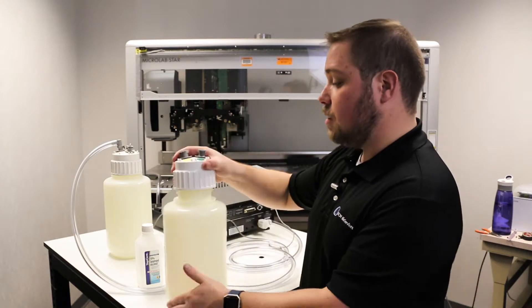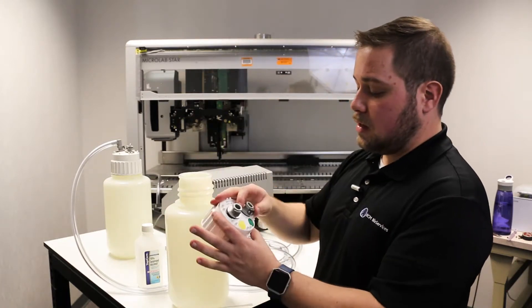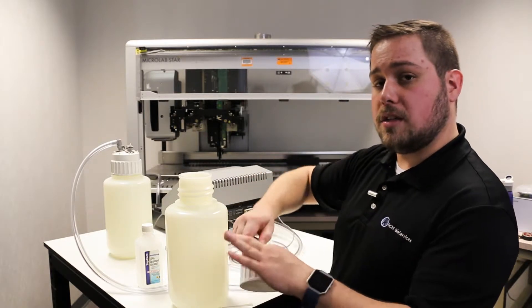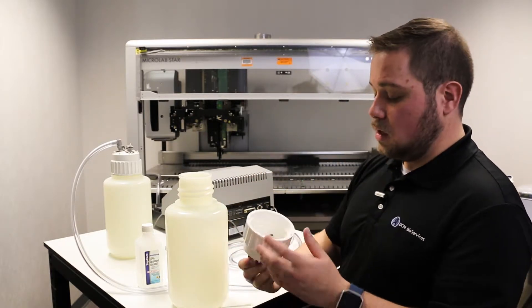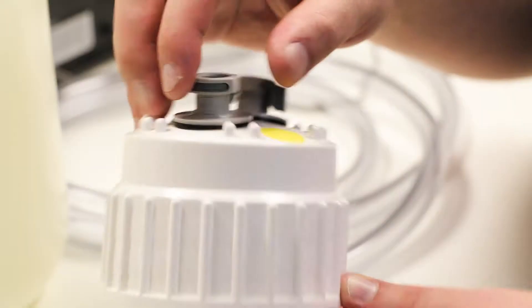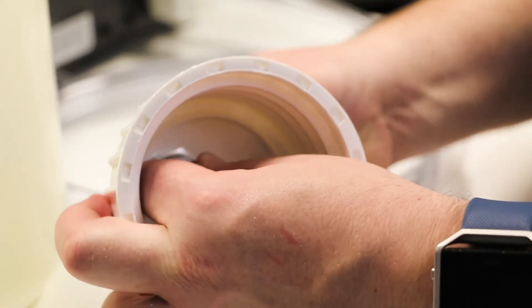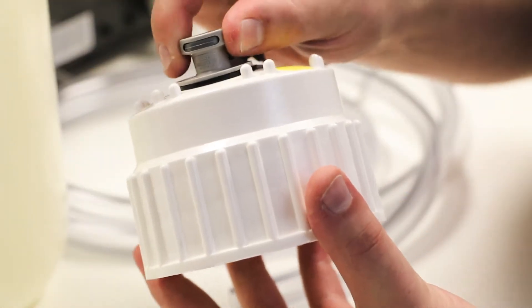To check that, remove the cap and take a look. If you can twist the fittings at all, that means that your lock nut is a little loose. You'll have to go onto the underside of the cap and tighten it. You can do this with your hands, but I'd recommend sterilizing the system first, as this is where your waste is held.